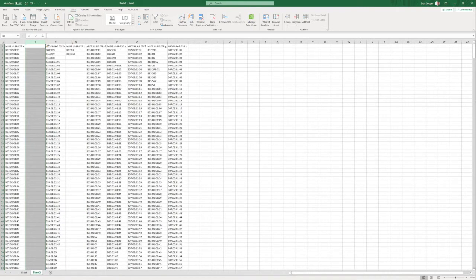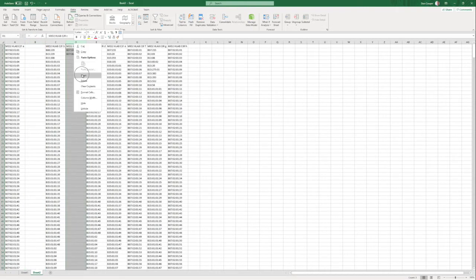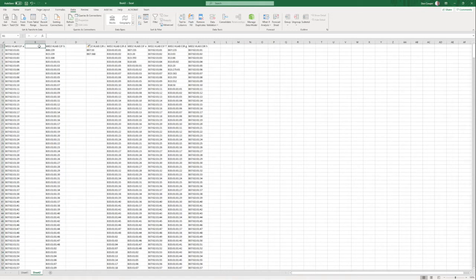Now we're going to add 2 more columns to put some formulas into. Insert, and we'll call these columns count. So as I said, if this is the true allele which was present, we should be able to find it in exon 2 reverse, exon 3 forward, and exon 3 reverse. So we should be able to see it 3 more times.